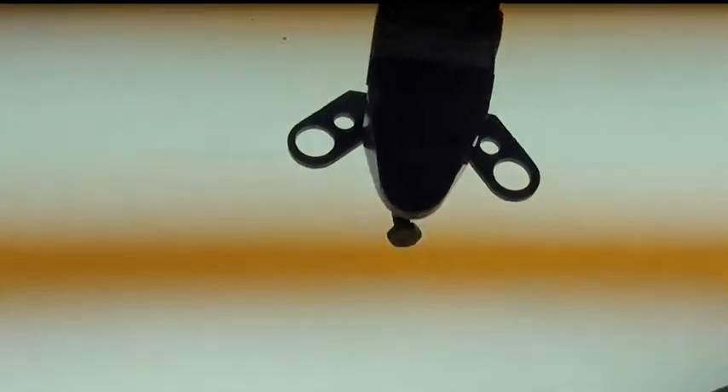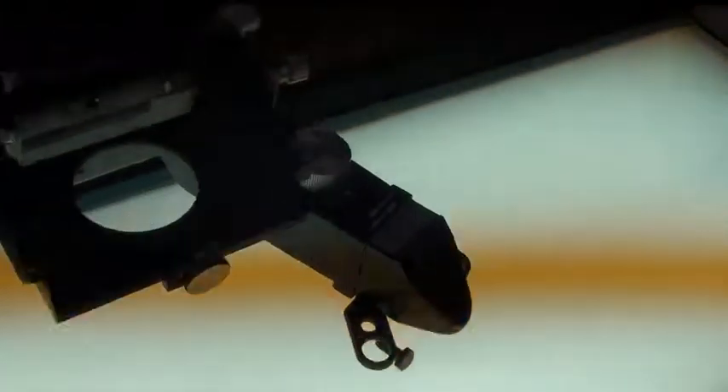As you can see here, we have a couple of objects set up underneath each microscope so you can compare the difference between the two with each lens. I'm going to try and get a shot of it for you.